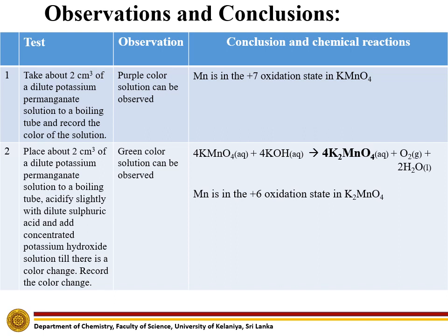In the second step, when this purple color solution is basified, it converts into a green color solution. This is due to the reduction of potassium permanganate to potassium manganate — that means from the +7 oxidation state to the +6 oxidation state. Therefore, this green color potassium manganate solution denotes the +6 oxidation state of Manganese.